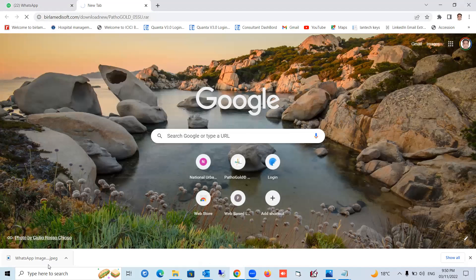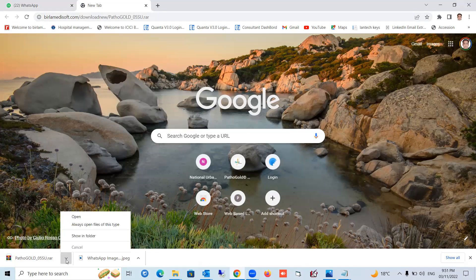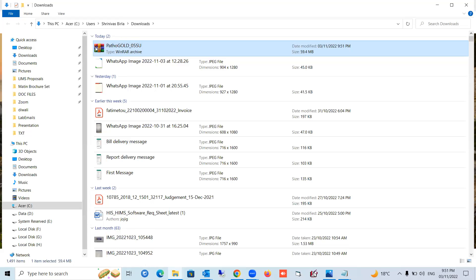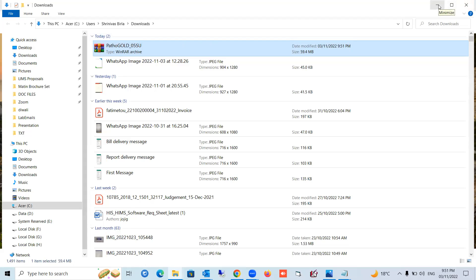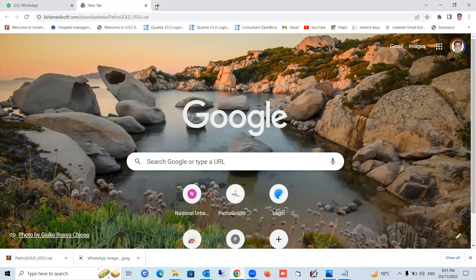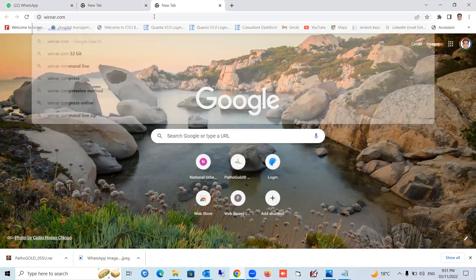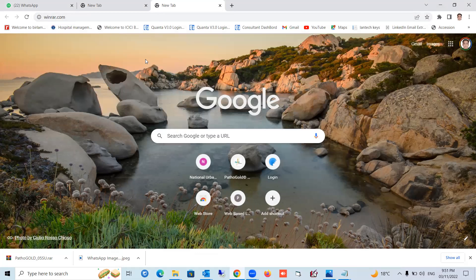The download will start. Once you download it, you need to extract the file using the latest WinRAR program. To open this file, you need WinRAR. You can download WinRAR from winrar.com. Download the latest WinRAR program from that website — choose the 64-bit or 32-bit version depending on your operating system. It's a small program.